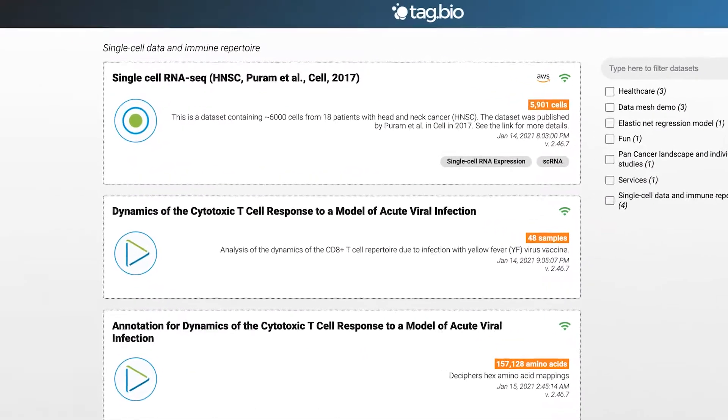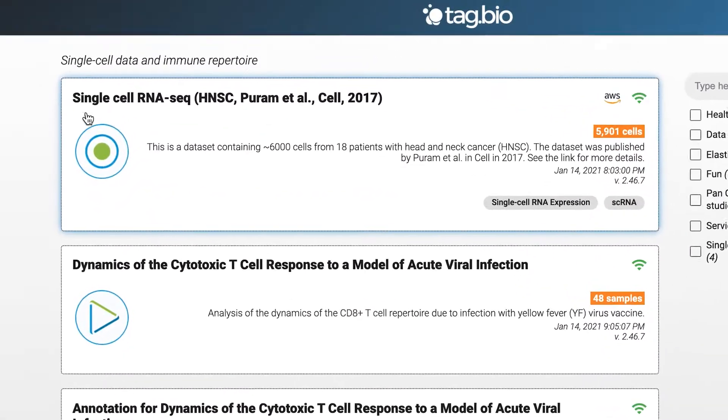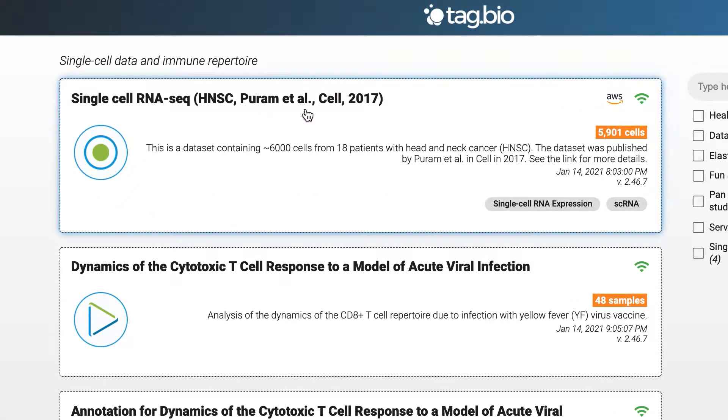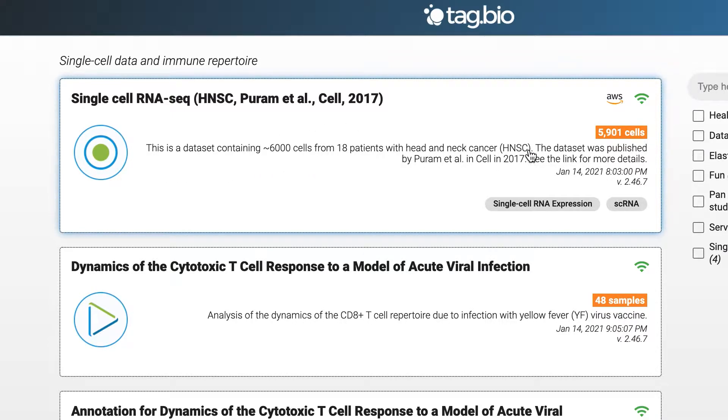First we're going to select a data node. We're going to use this node, it contains approximately 6,000 cells from 18 patients with head and neck cancer from a publication by Puram et al. from 2017 in Cell.